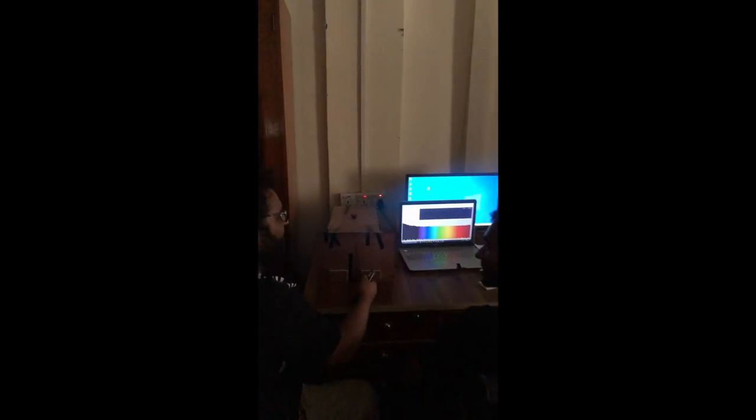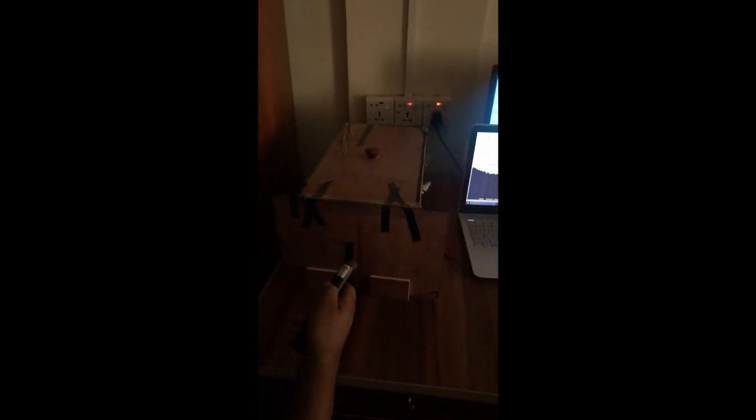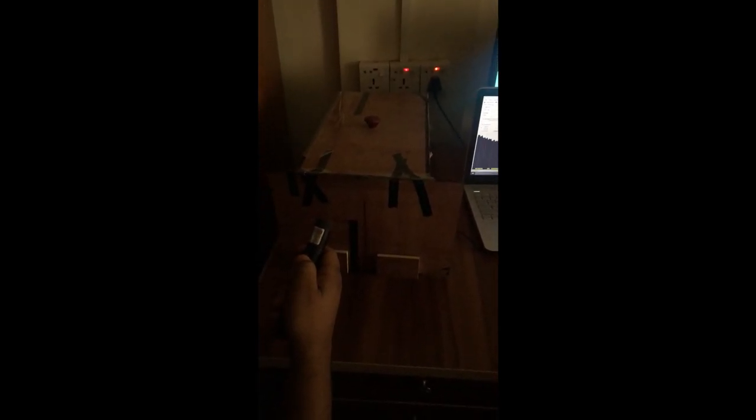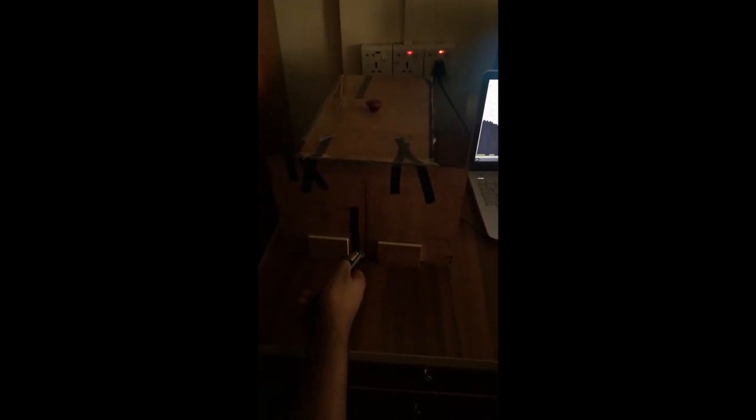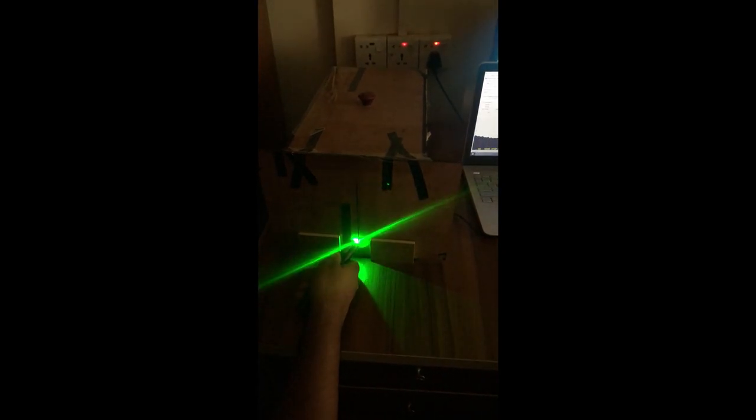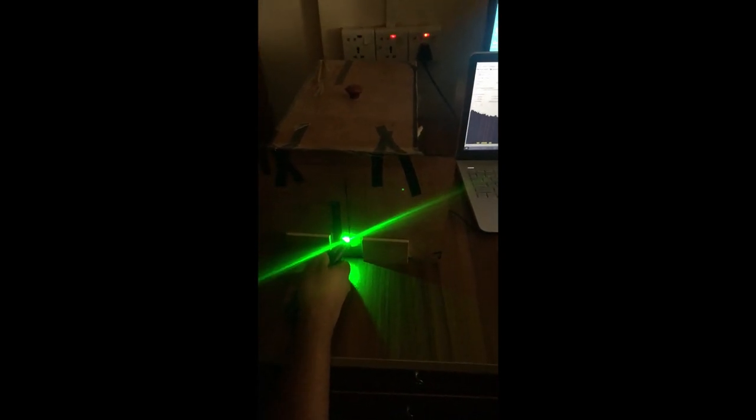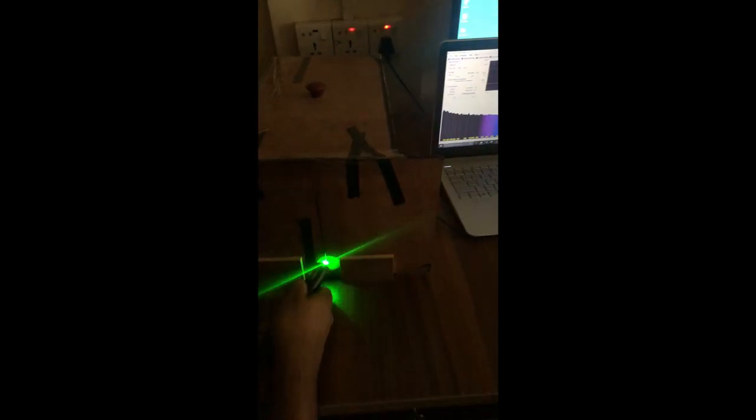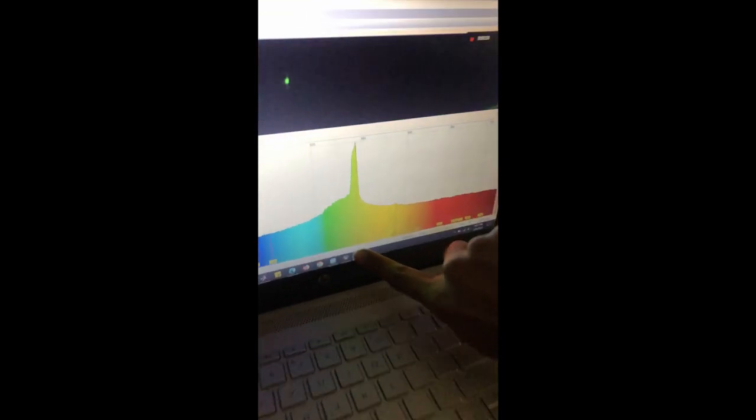Here, now we will calibrate our spectrometer. We will apply a laser which has a wavelength of 530 nanometer. And in the terminal app, we can see that due to the apply of the laser, we have a peak at 530 nanometer.